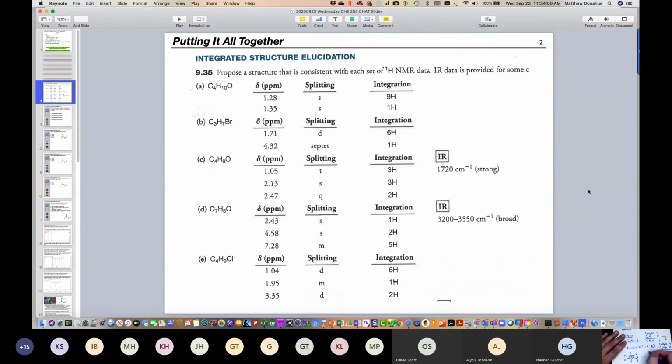So we've accounted for one of the 3. So we have 2 more. I guess we could consider two possibilities for this, right? We could have O, so O, CH3, or the only other possibility would be bonding the carbon, so that could be CH2OH. So those would be our 2 possibilities.